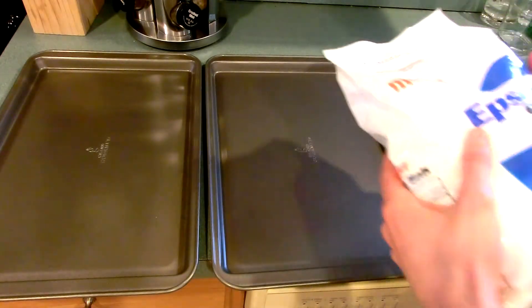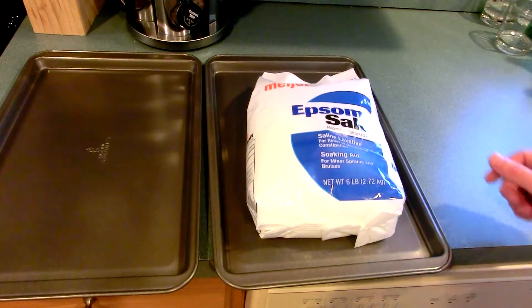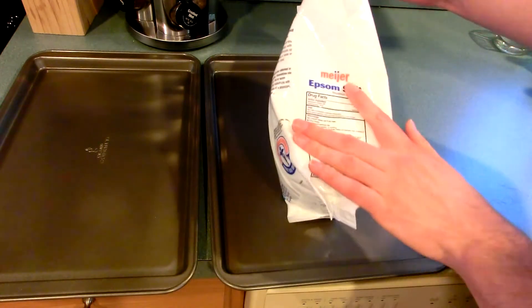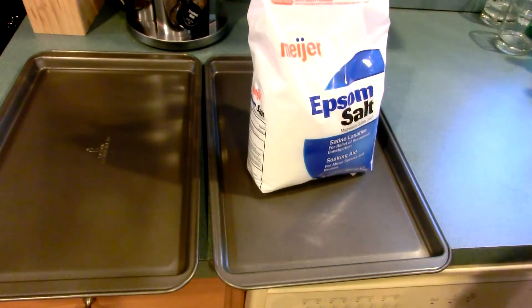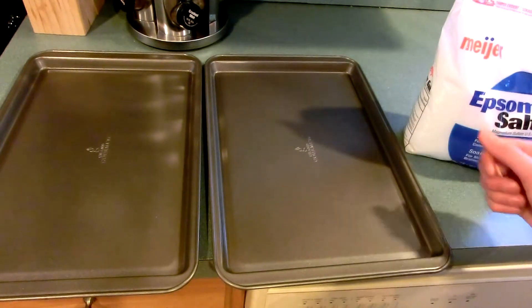To buy it yourself, it's pretty easy — it's just Epsom salts. You go to the store and pick up magnesium sulfate, which is of course the hydrated version: magnesium sulfate 7H2O. It comes as a free-flowing, sort of granular, crystalline salt. And all we're going to do is just pour it onto these baking pans and stick it in the oven.